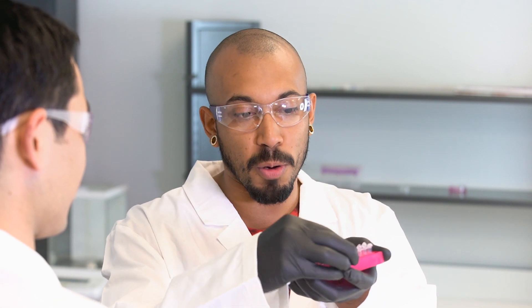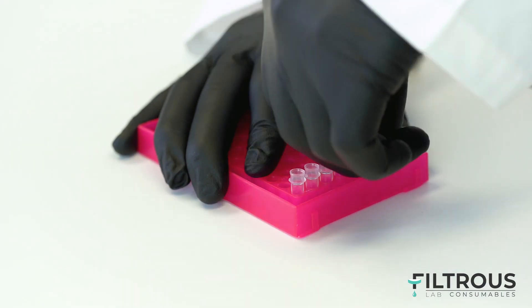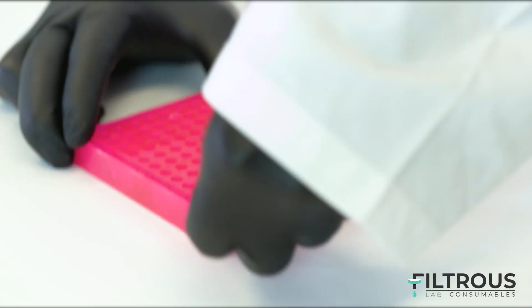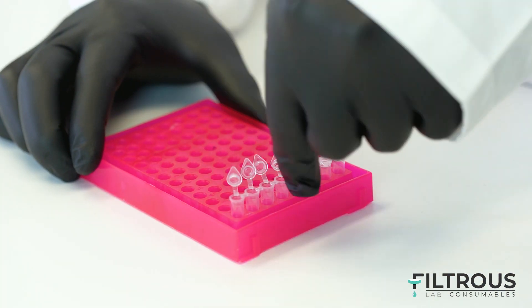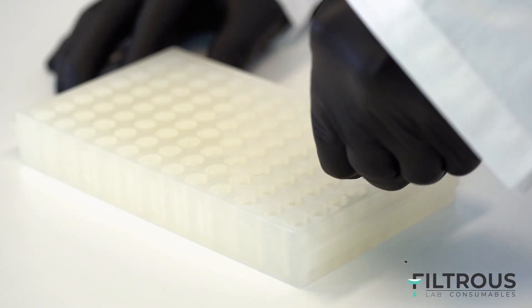Hey man, hey David. I'm trying to get these tubes open but I'm having the most difficult time. These tubes are so hard to cap and uncap — always giving my fingers blisters. I feel like my fingers are about to start bleeding. I just can't do this anymore. Stupid caps, stupid tubes.